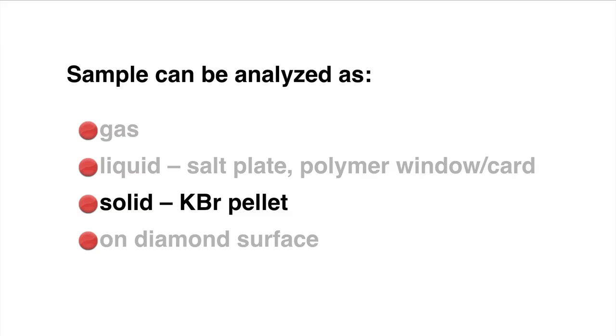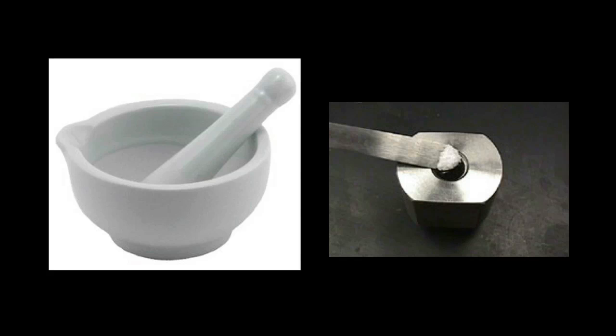Now if you have a solid sample, one of the most common ways of analyzing solids is by making what we call a KBr pellet. KBr, like sodium chloride, is again an ionic compound and so the ionic bonds in KBr are going to be IR invisible and will not interfere with collecting an IR spectrum using it. So KBr is a very soft salt, you put some in a mortar and pestle, grind it up so it's very fine, then you toss in a little bit of your compound. I usually do it in about a 10 to 1 or 20 to 1 ratio of KBr to compound amount analyzing.